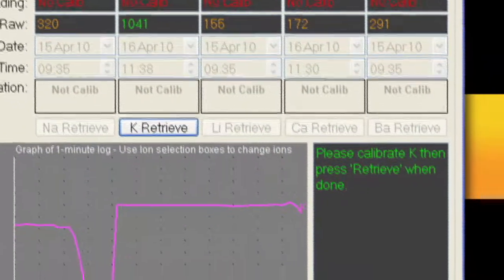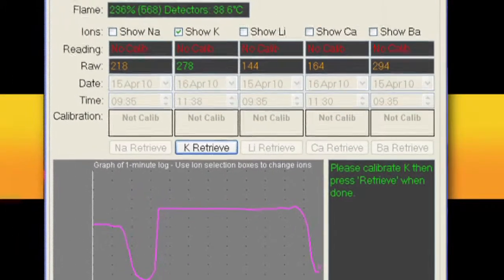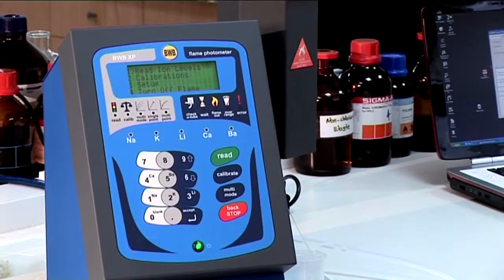If we want to calibrate several ions at several calibration points, we could repeat a multipoint calibration for each ion, but this would be quite time intensive.